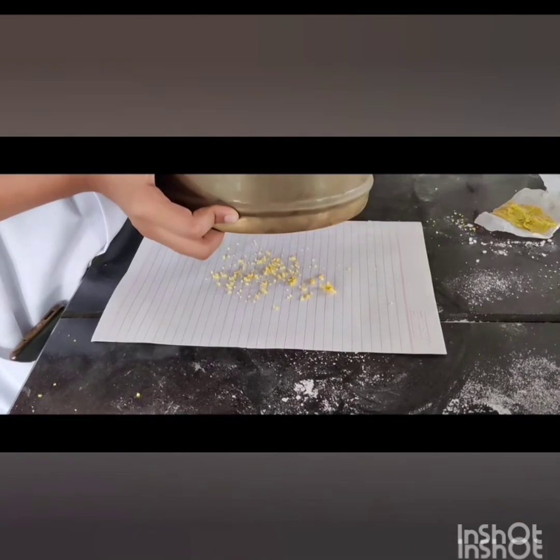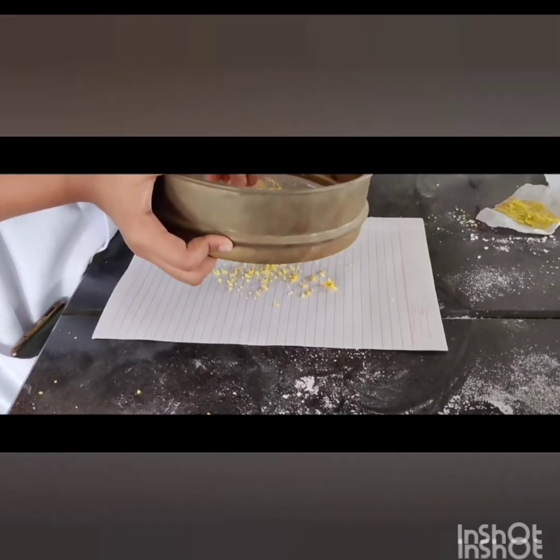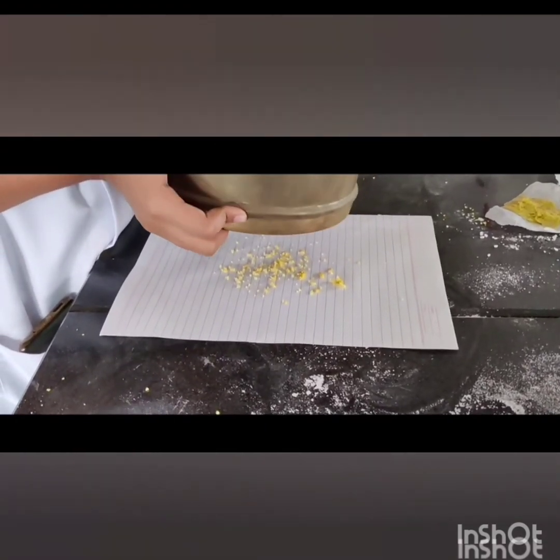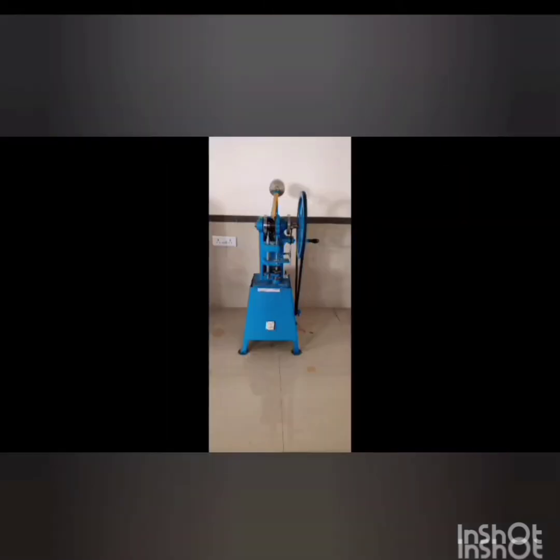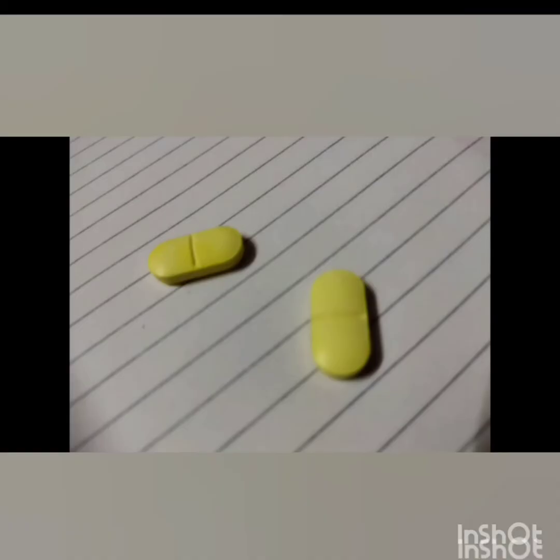After passing through the mesh, the granules are collected and talc is added. After that, we use a punching machine to compress the tablets, and the tablets are formed. Thank you.